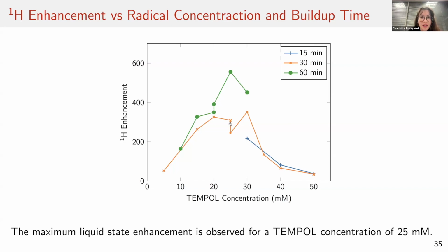Thank you. Okay. So there is a question from Cass. What is the future grand plans for the automatic loading system? Yes. So the thing that we really want to do with it is drug screening. So this ERC project that pays our bills and our salaries is set up to do drug screening. And so this is where we are going.